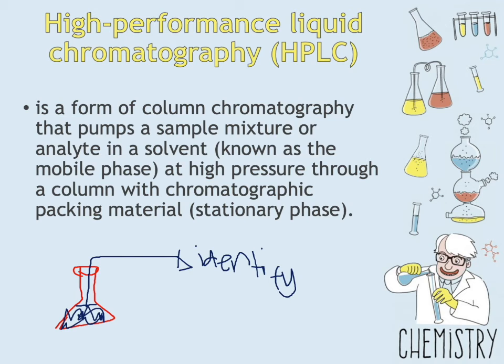But how? That's the question. How could HPLC be able to identify and separate any sample that can be dissolved in a liquid in trace concentrations? HPLC is used in a variety of industrial and scientific applications such as pharmaceutical, environmental, forensics, and chemicals.